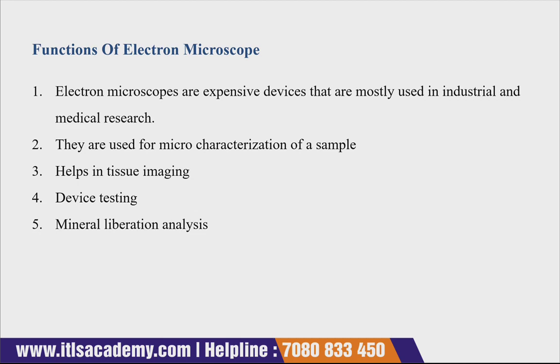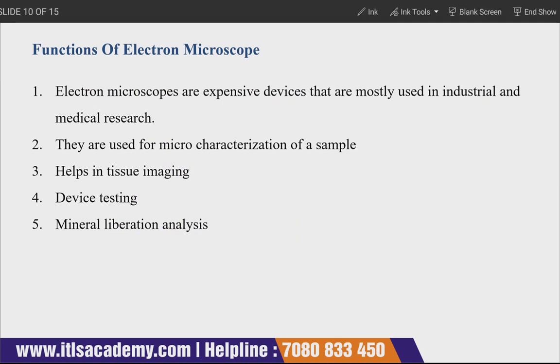Then comes the functions of the electron microscope. So what are the functions of electron microscopes? Electron microscopes are expensive devices that are mostly used in industrial and medical research. It is quite expensive and used in industries as well as in colleges, in academics, in medical research.